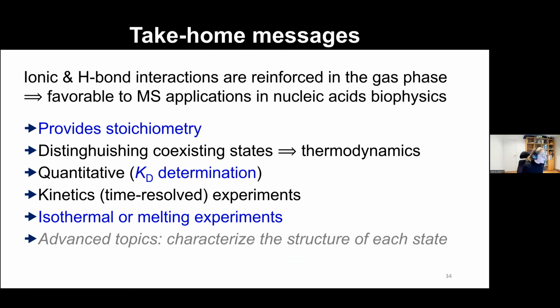So to wrap up, I'm going to end here, unless there are questions about ion mobility, then I can show the extra slides. The take-home messages I wanted you to get away with today: in the gas phase, ionic bonding and hydrogen bonding are strongly reinforced, and it's really the type of physical forces, the type of bonds that are important for quadruplex folding and also for ligand binding.